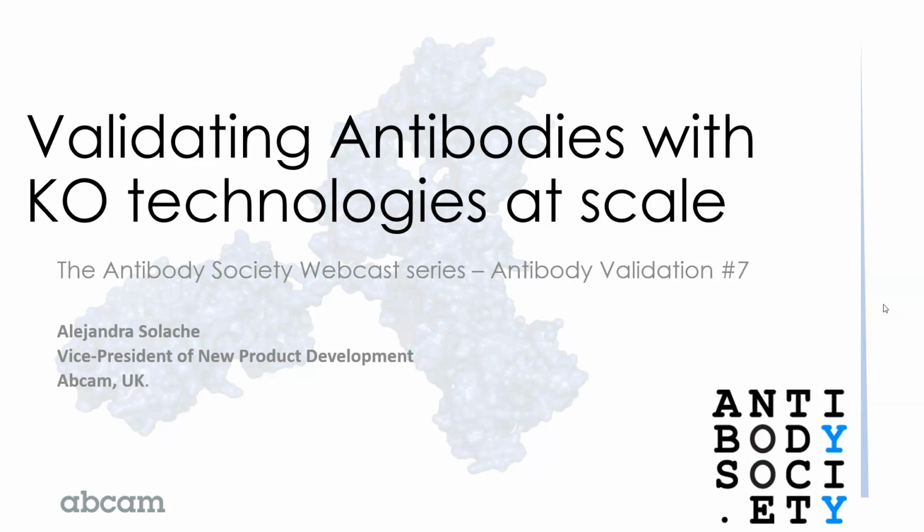We felt knockout validation gave us the high level of stringency that we need to confirm specificity, as well as the ability to utilize it at large scale. We wanted to go through this as a large effort and not just be able to do it for a small number of antibodies. And we believe this is something that now, with the lines becoming available, people in their own labs will be able to do much more easily than before.